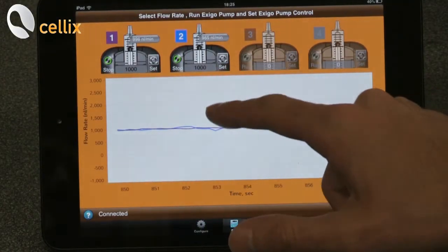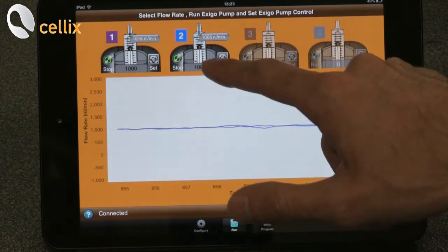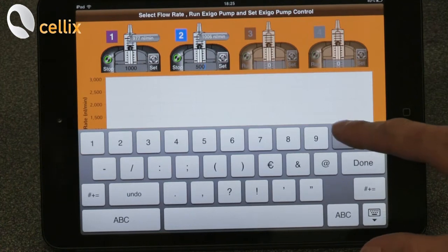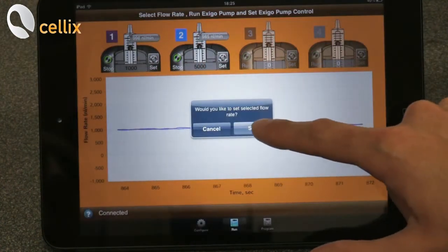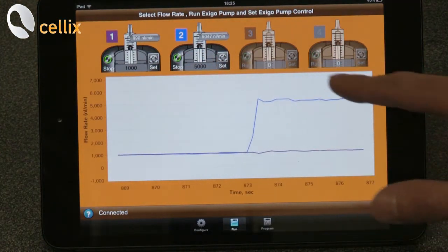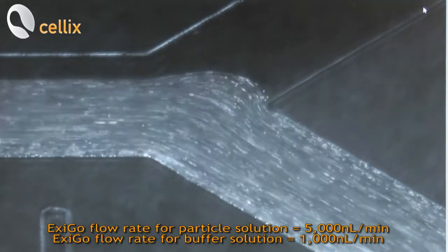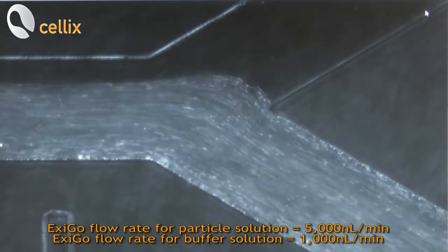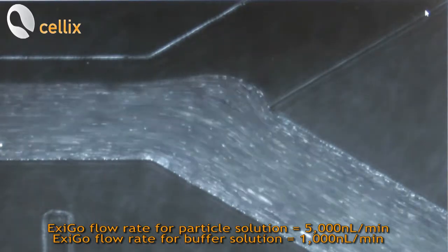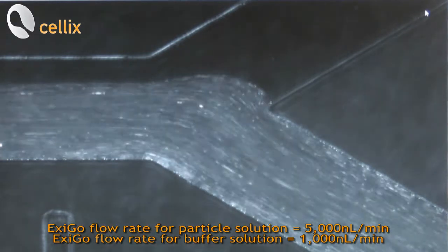We can try also to change the flow rate of the syringe which is perfusing the particles. So we click here. We can select for example 5000 nanoliter per minute. We click done. Set. And as we can see on the graph there is a variation. As we can see here now with the new flow rate, the interface results to be shifted towards one side because the flow rate of the particles is actually increased to 5000 nanoliter per minute.